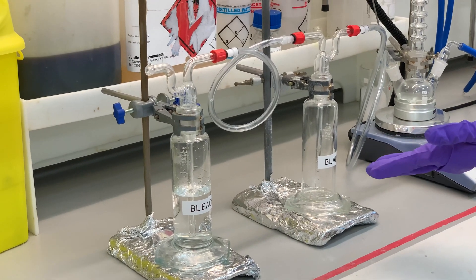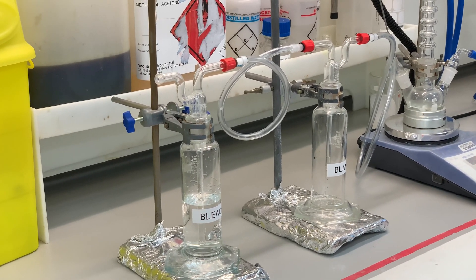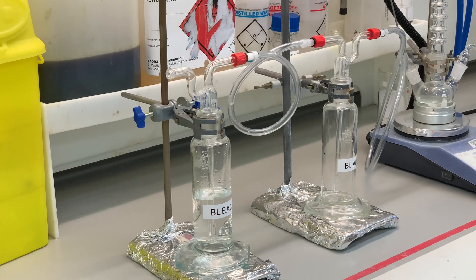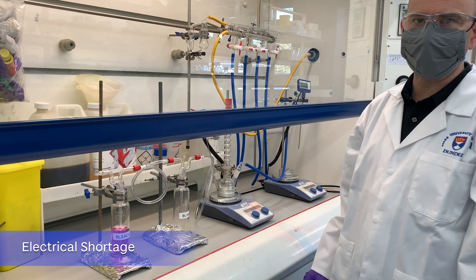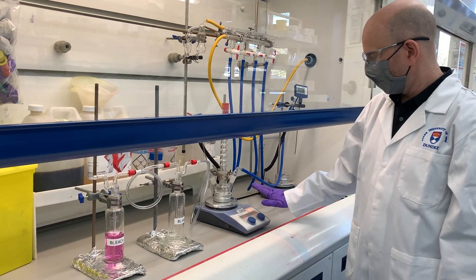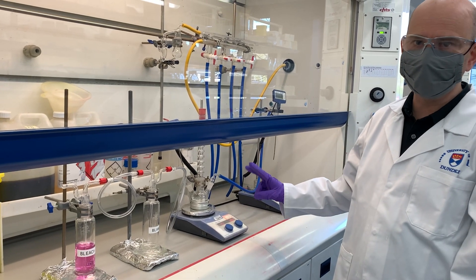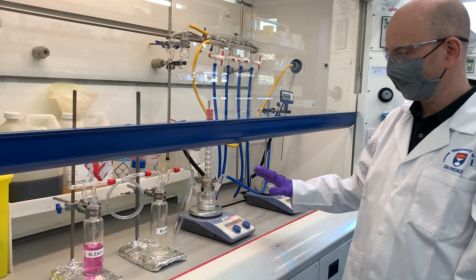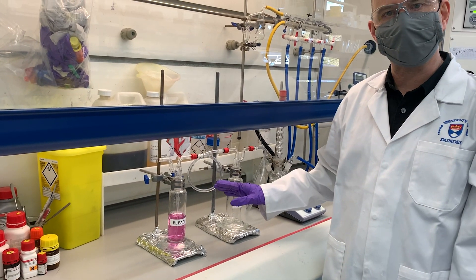If you go too slow you can start to see suck-back into the tube, so you just need to make sure you've got enough nitrogen — some bubbles, but not too fast. Now I'm going to show you what would happen in the event of an electricity failure where a hot plate stops working and the nitrogen generator also stops — a double failure. We've coloured the quenching solution so it's easier to see when it gets sucked back through the tubing.